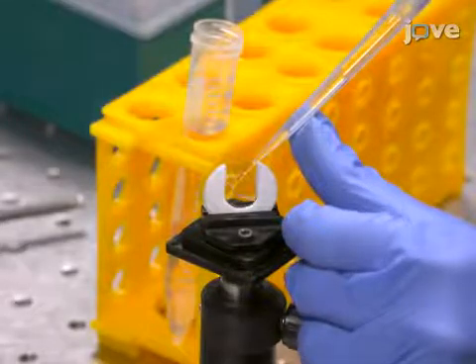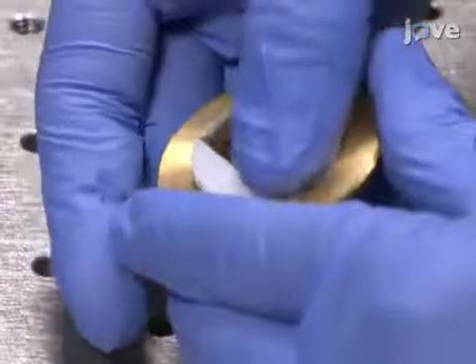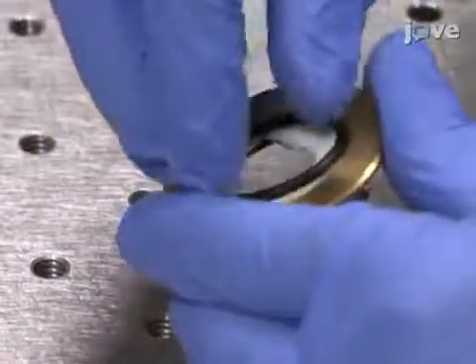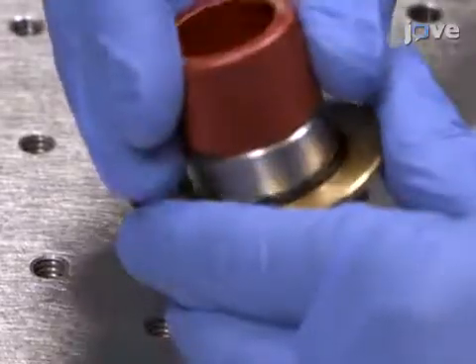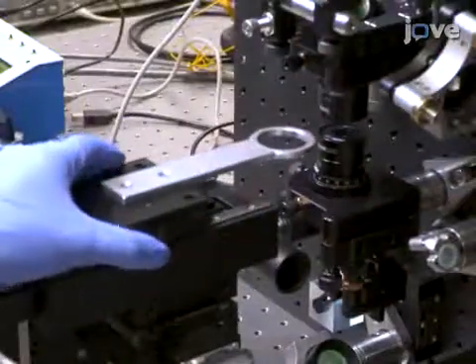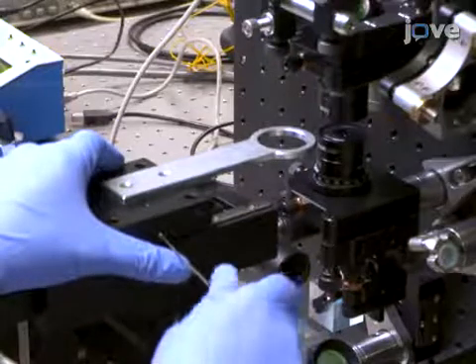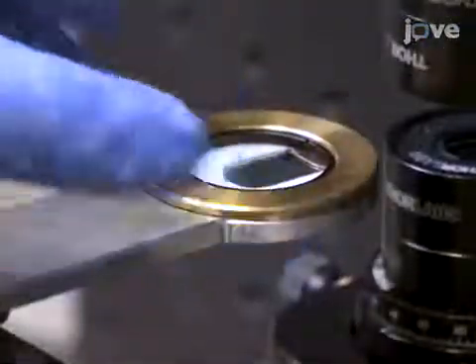Then, fill with distilled water a sample chamber made of two 25 mm diameter, 0.17 mm thick glass coverslips and 500 micrometer thick polytetrafluoroethylene tape. Mount a chamber holder on a three-axis motorized translation stage, then secure the water sample in the chamber holder.